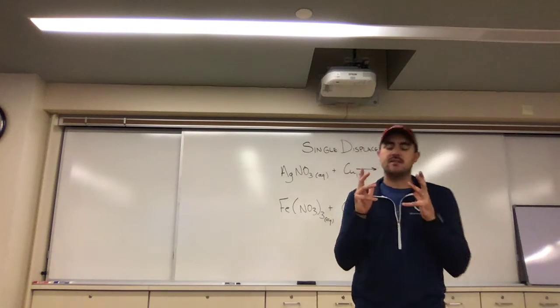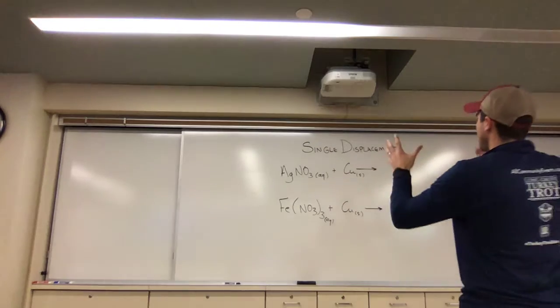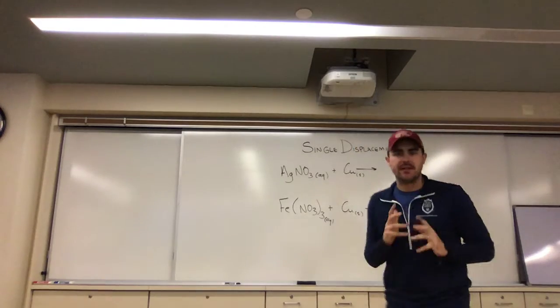All right, everybody, Mr. Gustin back in the chemistry classroom with your last two reactions. They both fall under the category of single displacement, but here's what I have for you.